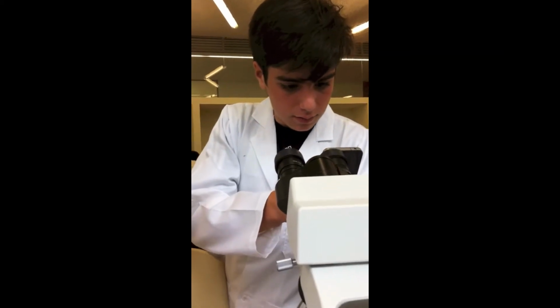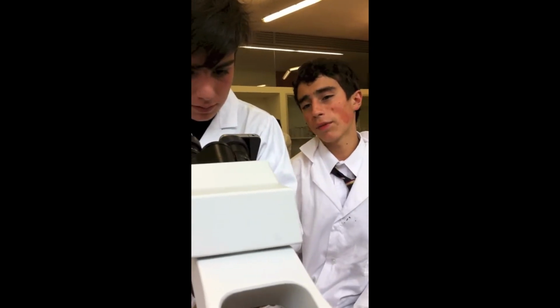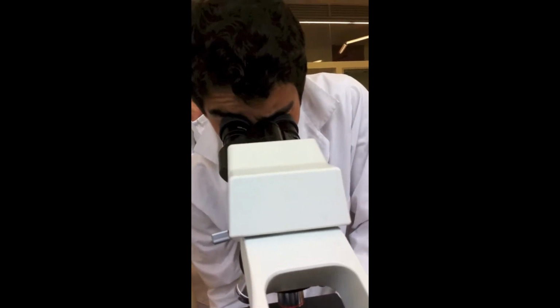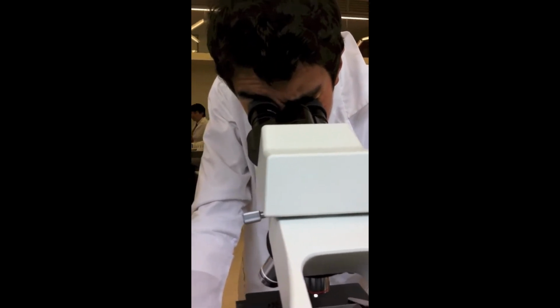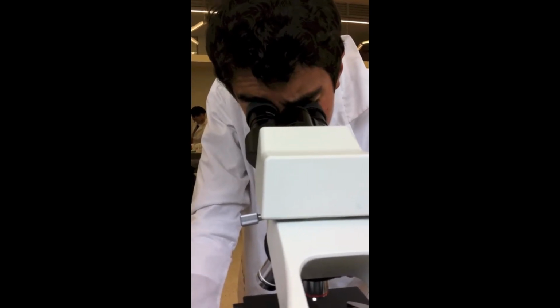After the observation and comparison between samples, we made our own sketch and description of what we had seen in our different samples and with every power of the microscope. Then, as a part of the activity, we held a discussion with some questions.